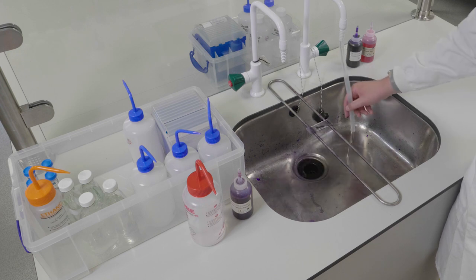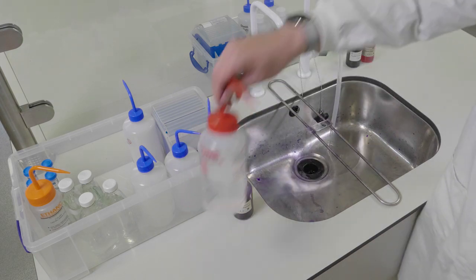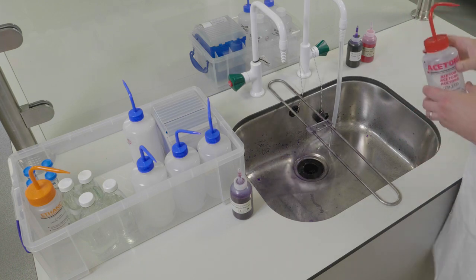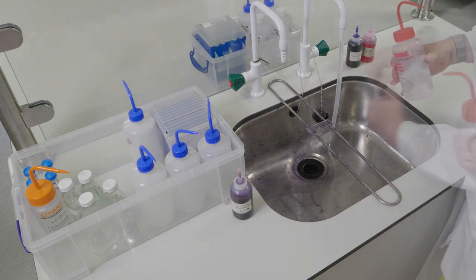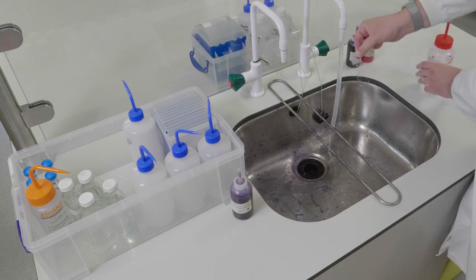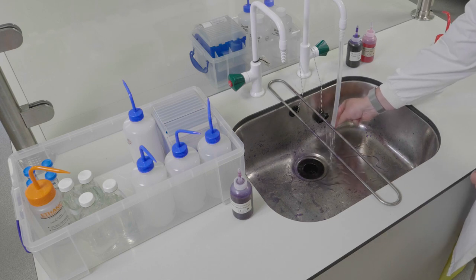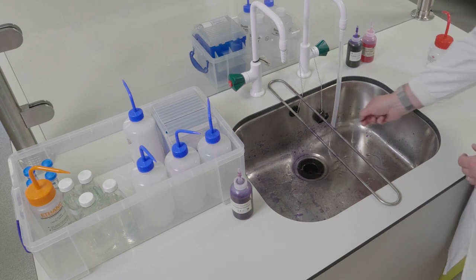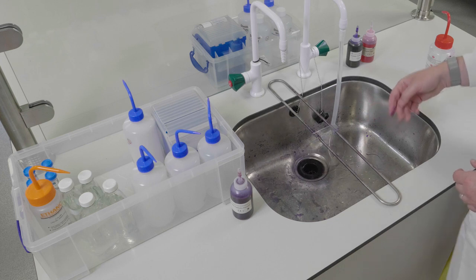Next is the critical part of the gram staining process. Take your acetone and pick up your slide. Run the acetone down the slide before immediately rinsing it off. Do not let the acetone sit on the slide as this will lead to a loss of colour with gram-positive organisms.